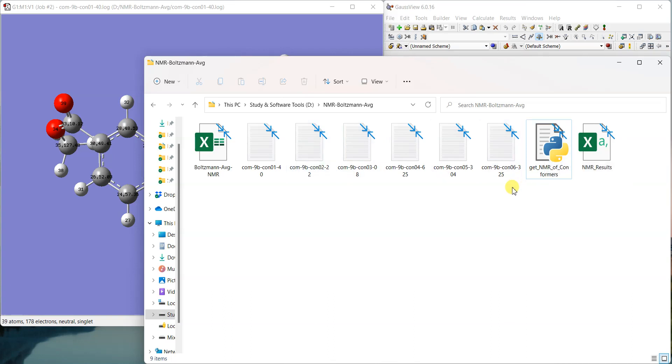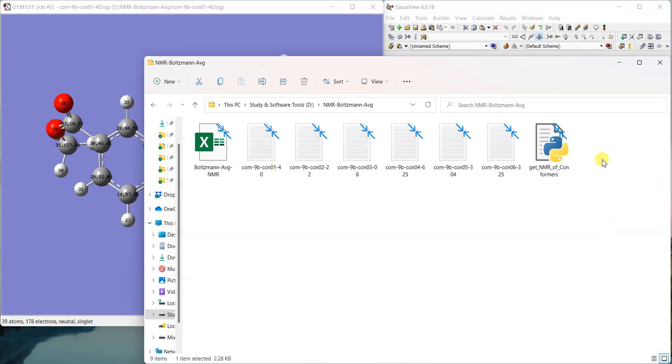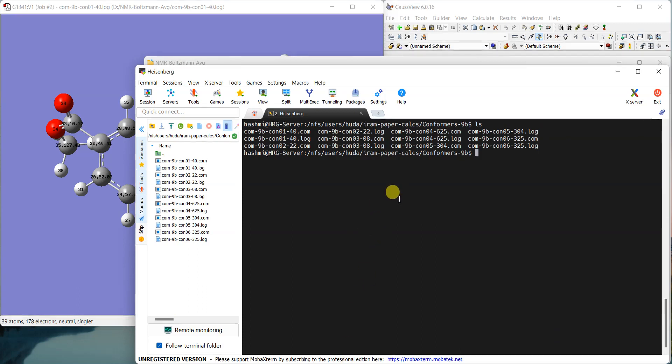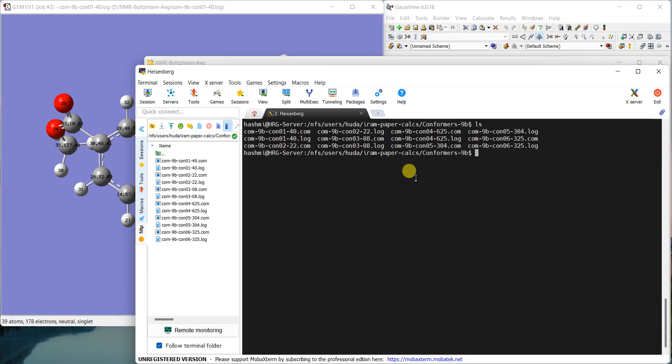If it runs perfectly, you can get the NMR data here very easily. I'll just delete this file because it will be generated by the script. Let's have a look at Windows. I didn't try it before, but we can do it. I hope—there was an error. So I'm not going to install different modules in Windows.